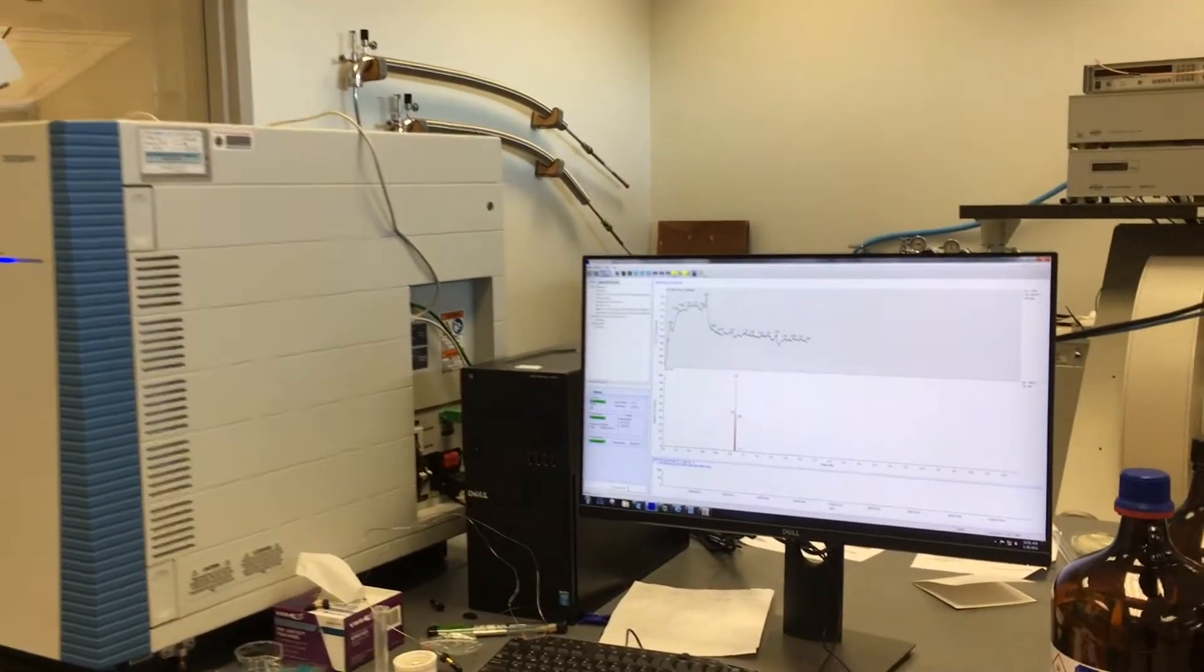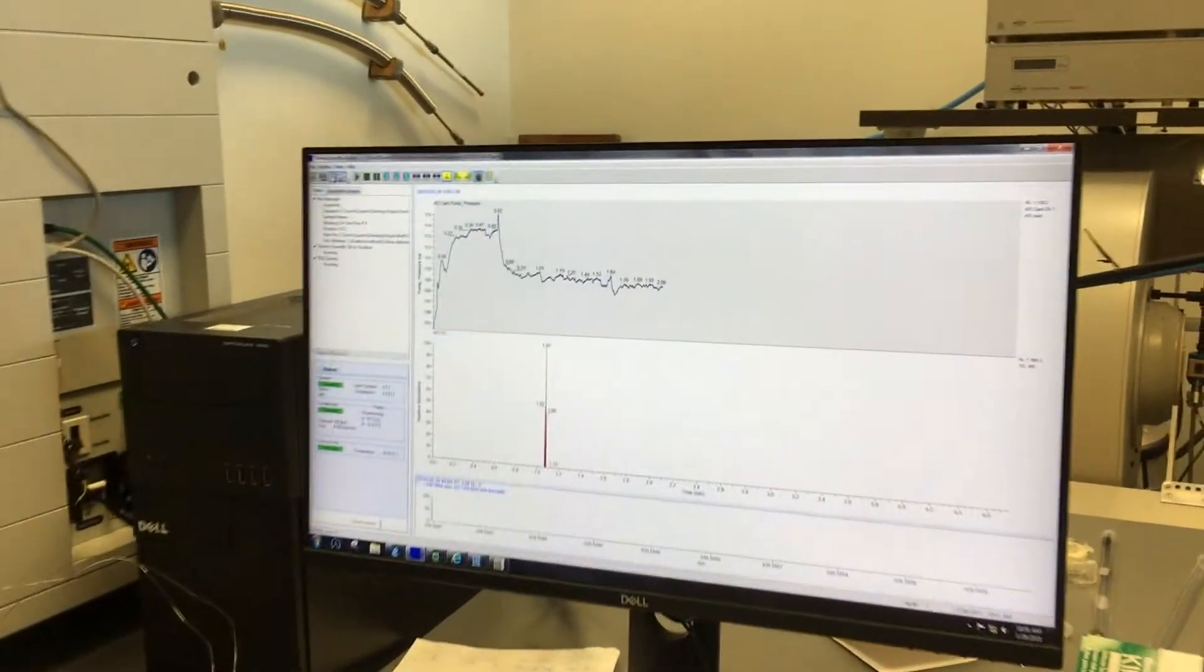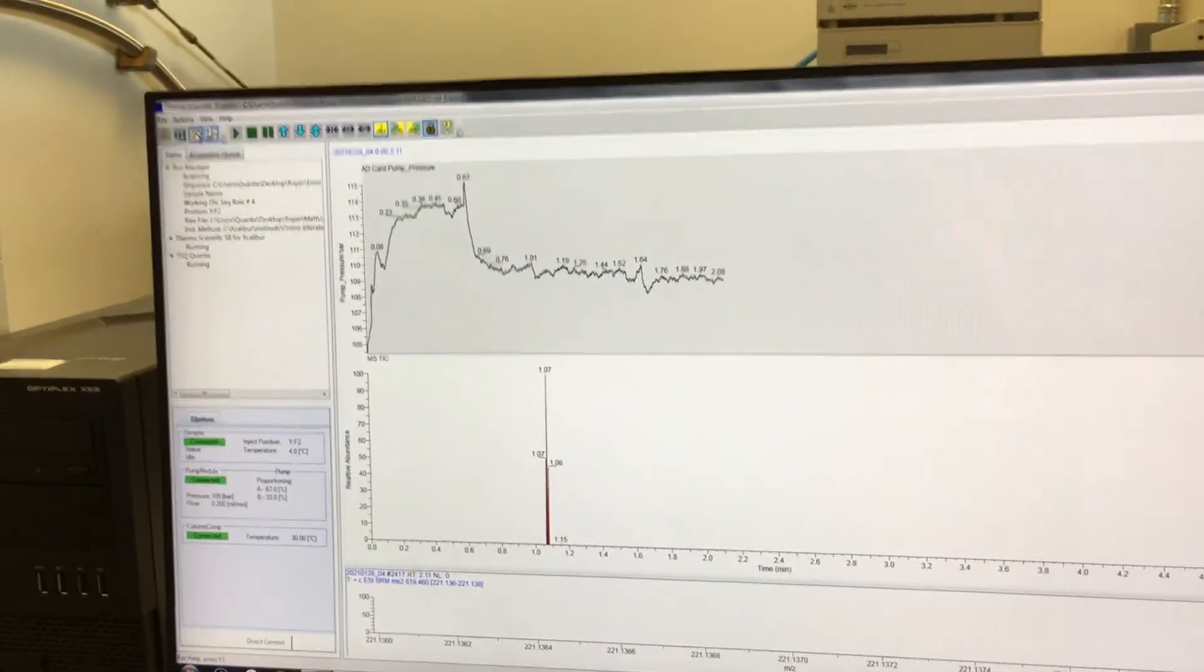From achieving ultimate sensitivity requirements, robustness, reliability, and speed, triple quadrupole LC-MS systems help you address your challenges in routine, targeted quantitation for all molecule types.